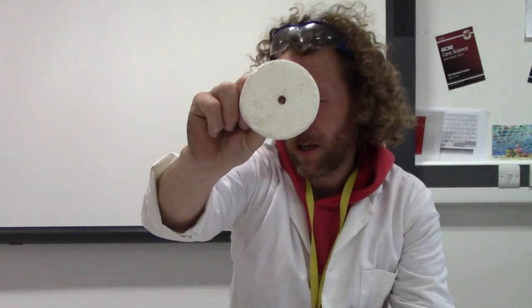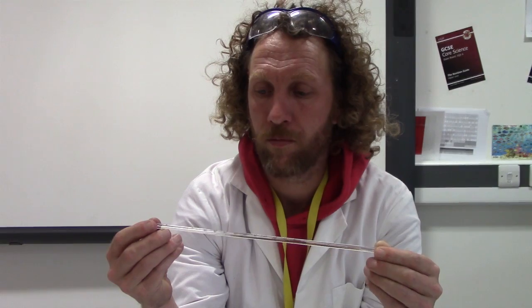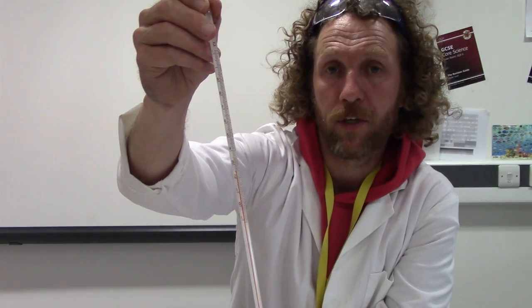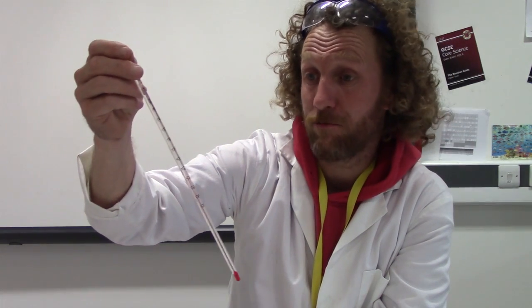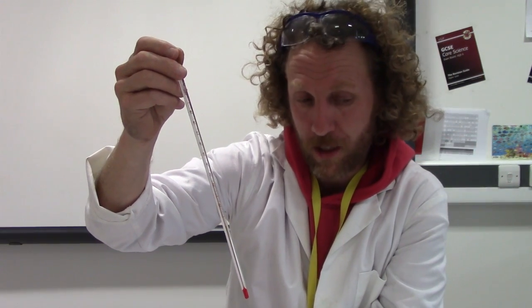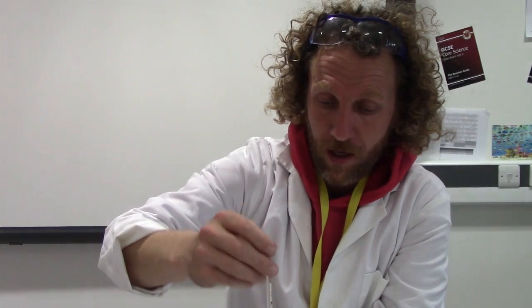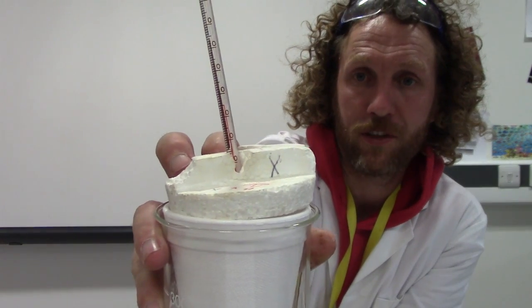We're only adding small amounts at a time and we're going to be adding them to a polystyrene cup inside a beaker to make it extra stable so we don't knock anything over, with a polystyrene lid and a thermometer hole. Which is a big clue for the fact that we're going to need a thermometer. We're going to use quite a long one, about 30 centimeters long, and that is good for a couple of reasons. First, it is easier to take readings because temperature changes in chemistry can be quite small. Secondly, because it's long, the bulk of it pokes out of the lid so a reading of 20 degrees is already visible — we don't need to lift it out. Don't lift your thermometer out when taking a reading because then you're no longer measuring the temperature of the solution.